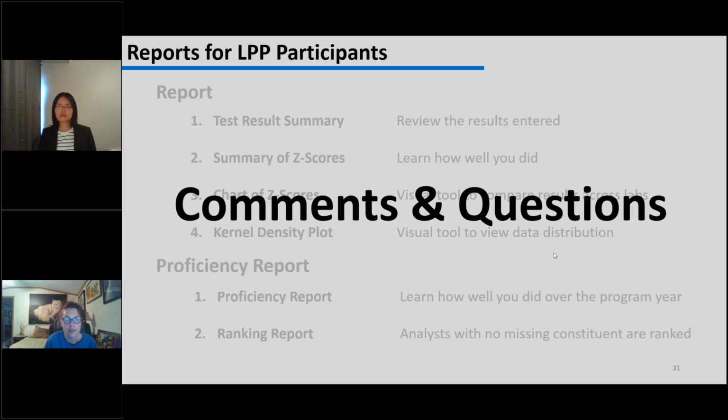If you have multiple analysts, we would need to sign up for multiple samples to get them approved status. So I'm assuming the question here is, would the analysts have to be individually enrolled in the series that they would like to be approved chemists for? Yes. The program is designed so that the submitted result is from one analyst, and it is an assessment of one analyst's performance over the year. So if you have multiple analysts, for them individually to be accredited approved chemist status, they need to be in the program individually.